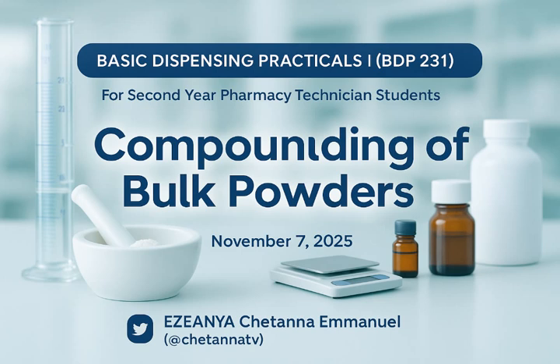Now, the big question is this: how do you add overage? Do you just take any amount you like and start adding anyhow? If you do, you mess up the product. So the overage you are going to add, listen carefully. I didn't add overage here, right? But in the actual practical, you must add your overage. So I'm going to generate another formula where overage is added. The overage should be proportional. You don't just add overage anyhow.